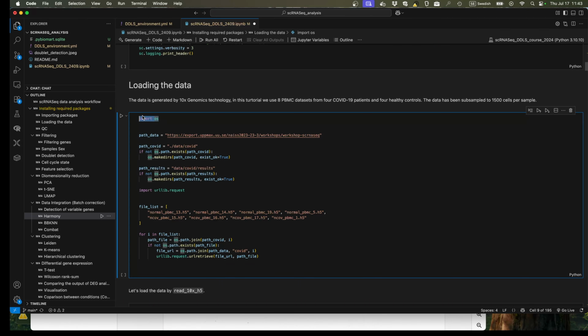First of all, I import OS again. I usually try to put all the packages at the beginning of the Jupyter notebook, so we can see all the packages used in the analysis, and then we can plan which packages or dependencies we need for the data analysis. But here I have also used it here, but that's just a minor detail.